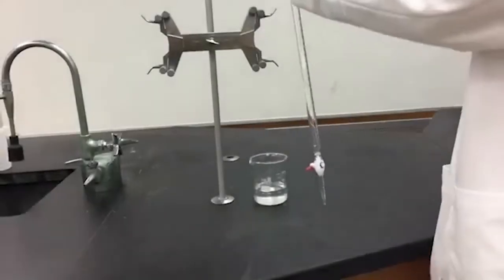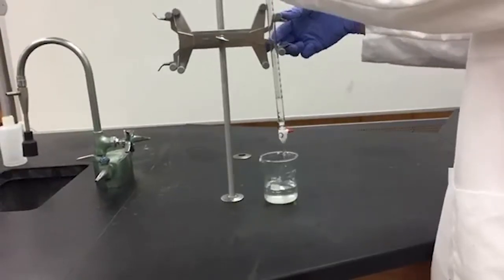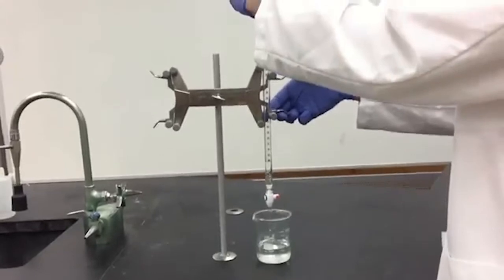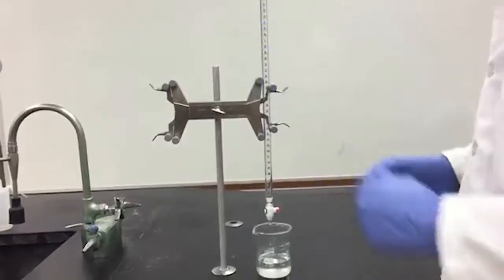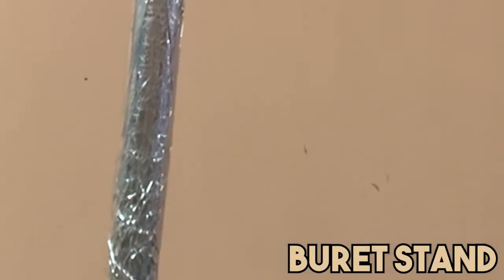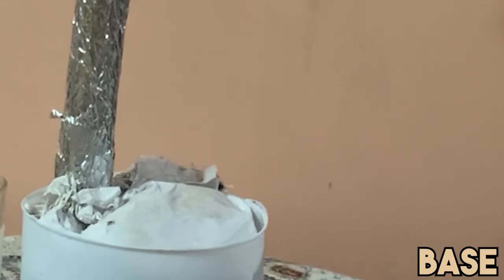Furthermore, we will be showing you our whole burette setup. As you can see here, this is the original burette setup when we are in laboratories. However, we had to make use of alternatives for the materials that we lack. Instead of a burette stand, we made use of a metal pole that is similar in height to burette stands. For the base, we used a weighted plastic container so that the whole setup will not tip over.